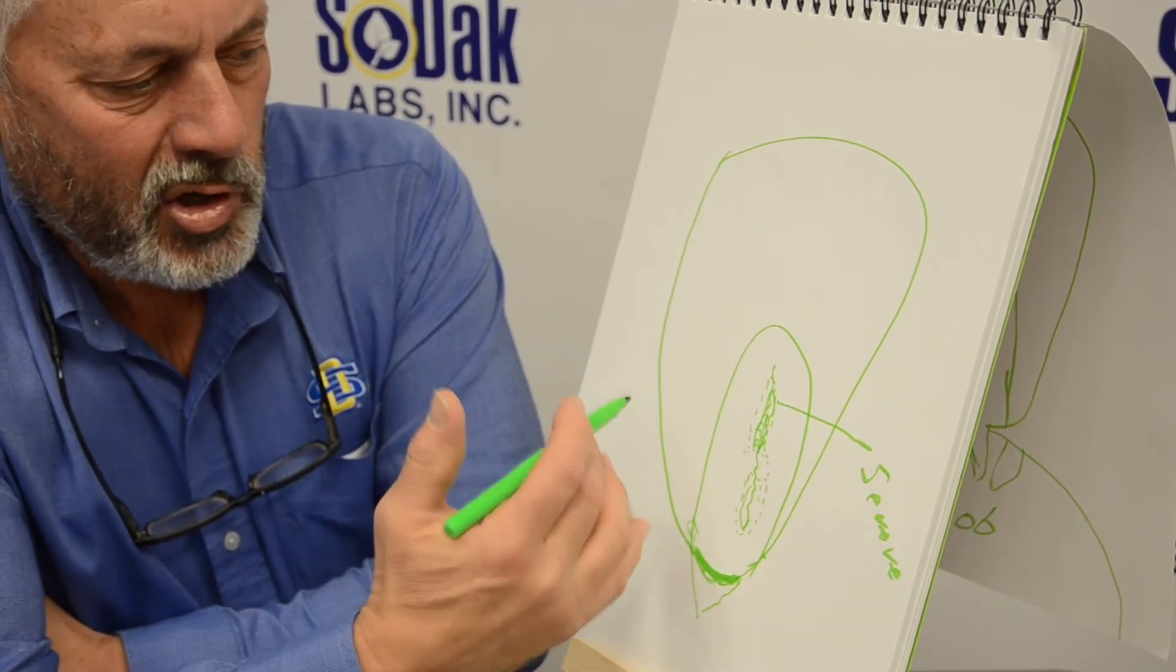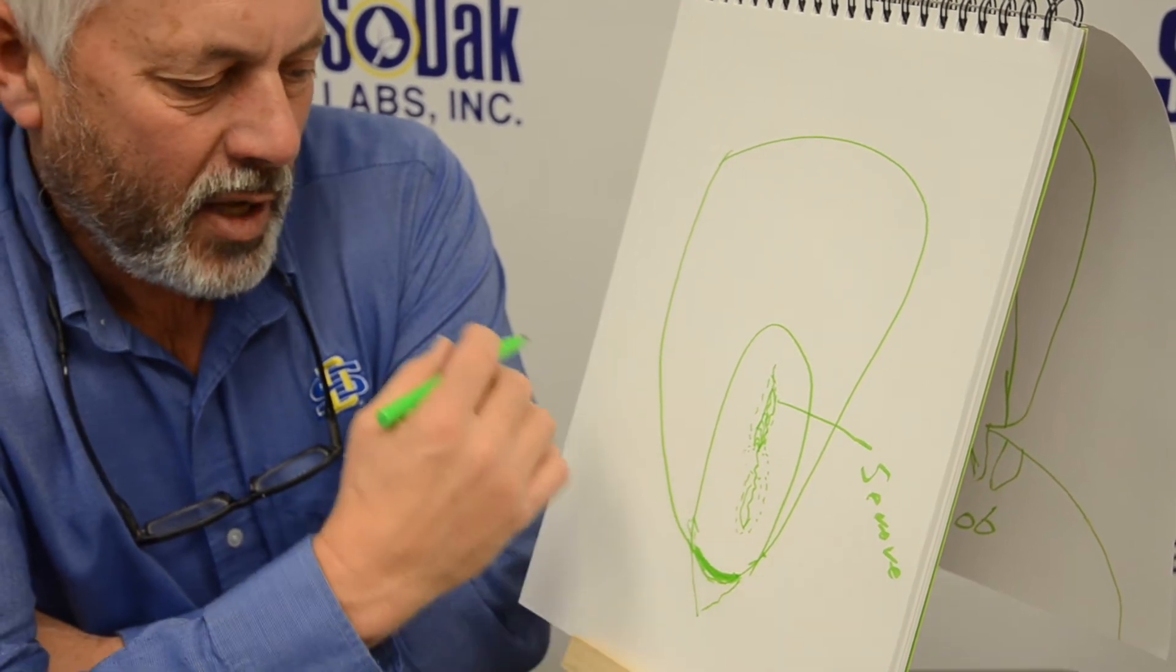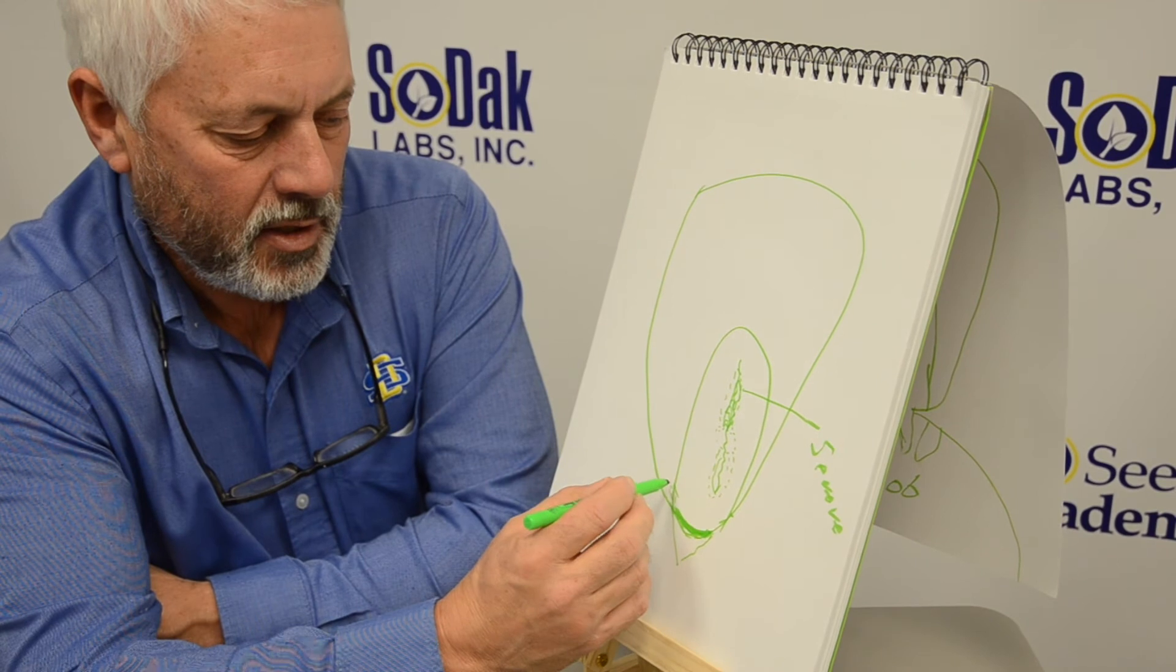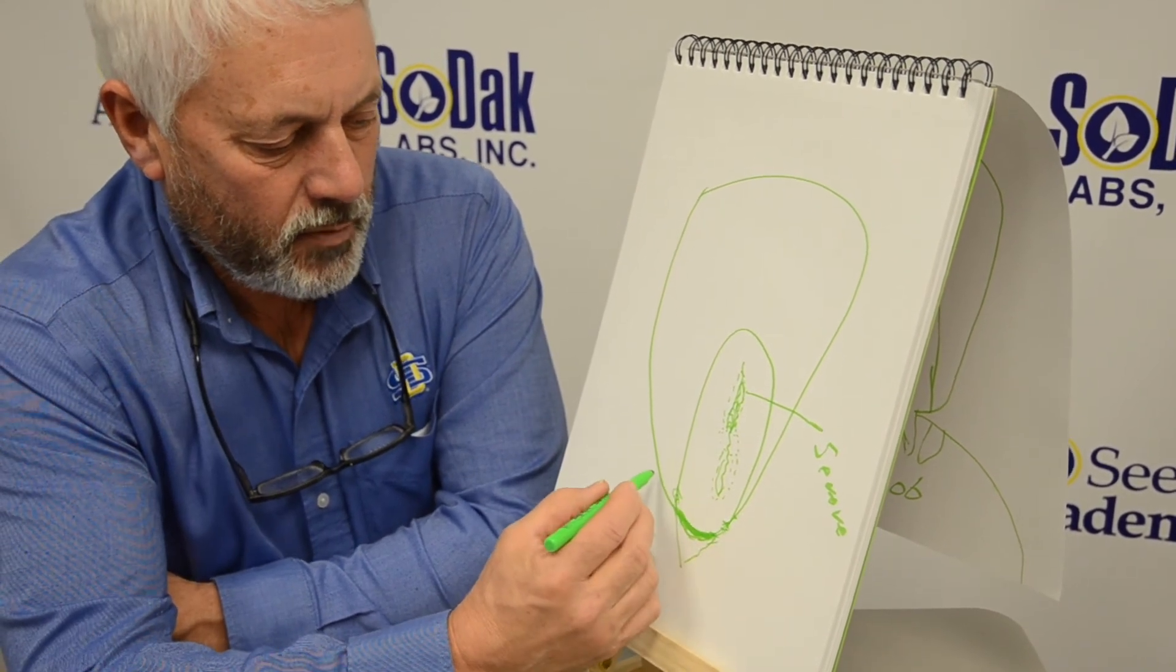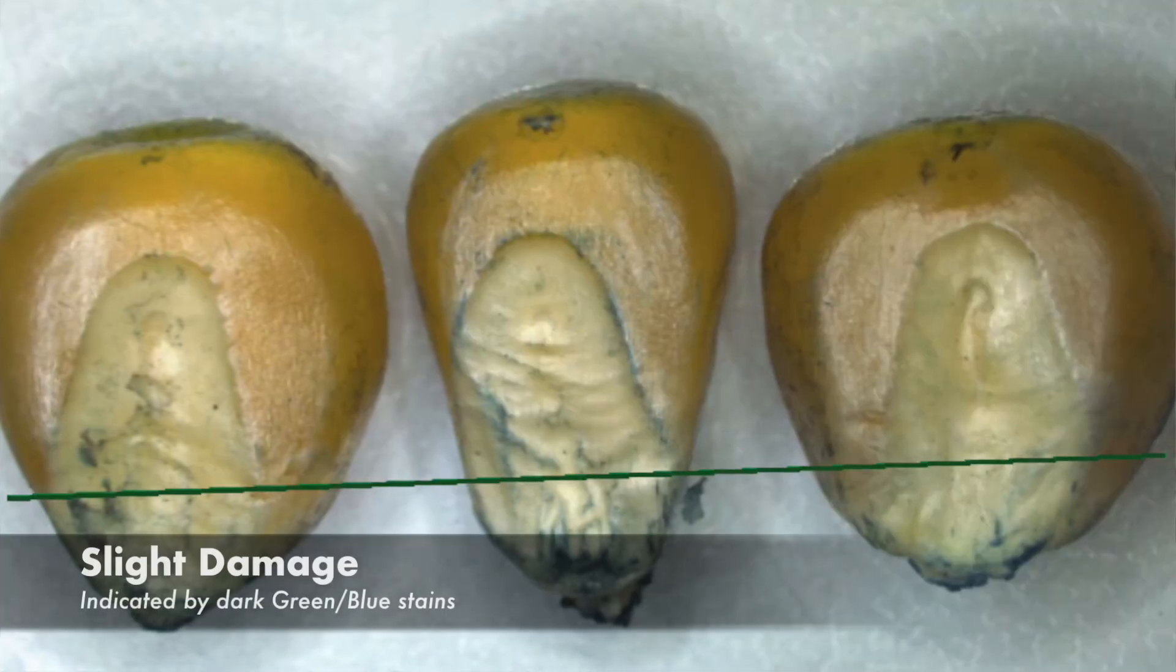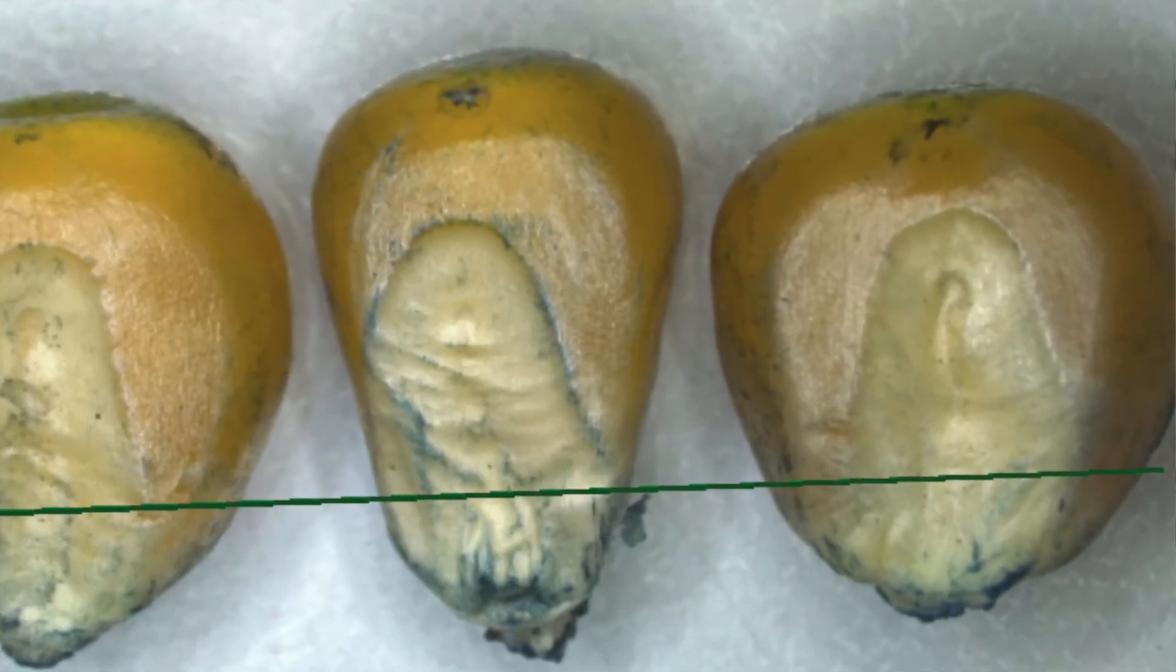If we tear the kernels out of the cob, say the cob is still a little wet and we have to tear them out, they don't shell out nicely. Sometimes we get tearing right here, and if it's in the very lower part of the germ face, like right here, we call this slight.